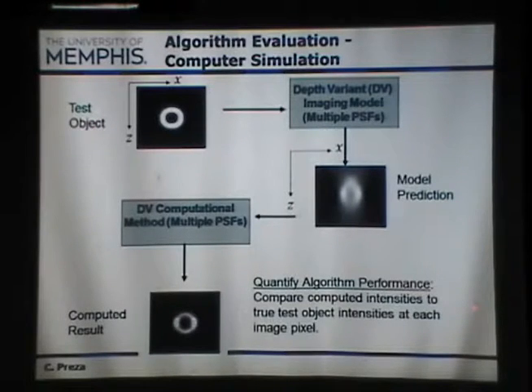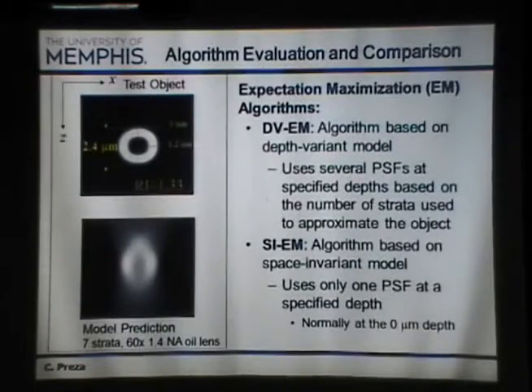As you see here. So we do this simulation to quantify performance. So we can compare the intensity at every pixel here to the intensity in the true model object, and determine how well the algorithm is doing.